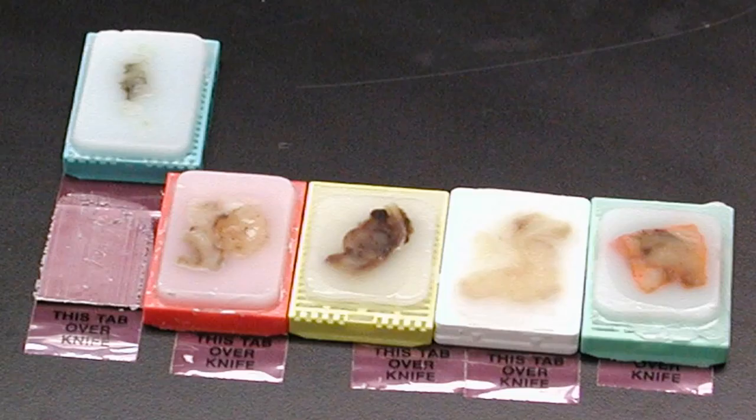When tissue is extracted from an organism, it requires preservation. In histology, the standard technique of preservation is to embed the tissue in paraffin wax and fix it with formalin. After removing the blood, tissue is placed in a formalin solution for fixation. Fixation holds the structure inside the tissue in place. Tissue that is obtained from patients and organisms is often embedded in a wax block of paraffin. All tissue needs to be embedded before it is cut for slides. Here, we have a picture of certain tissue samples that have been embedded.